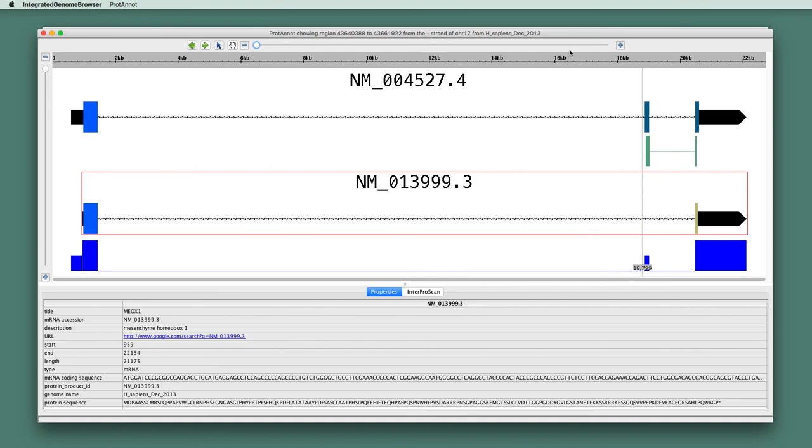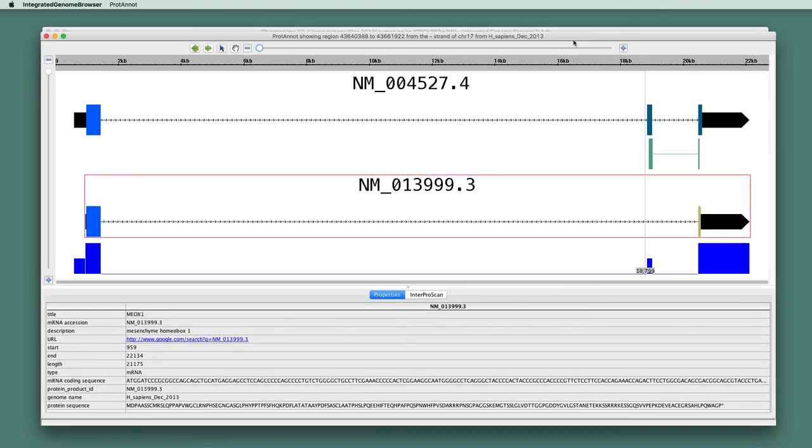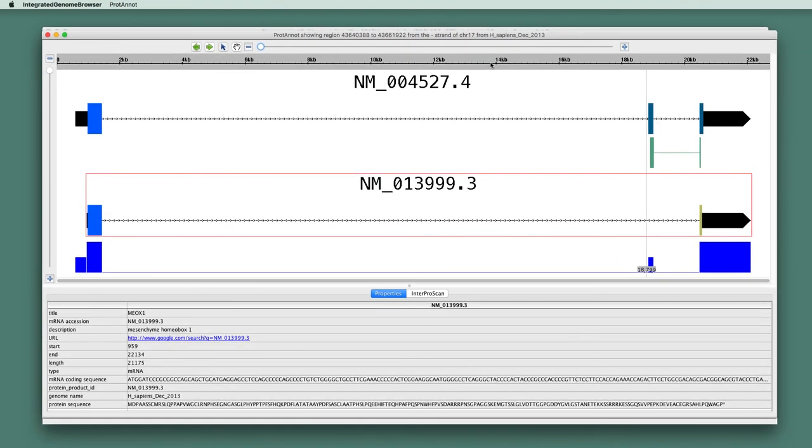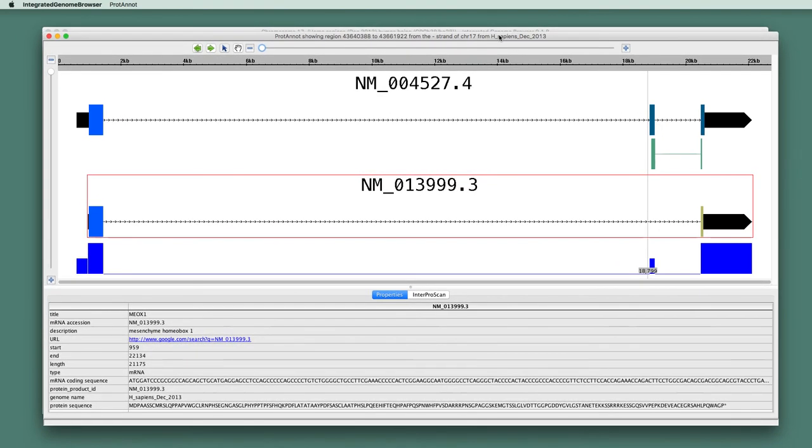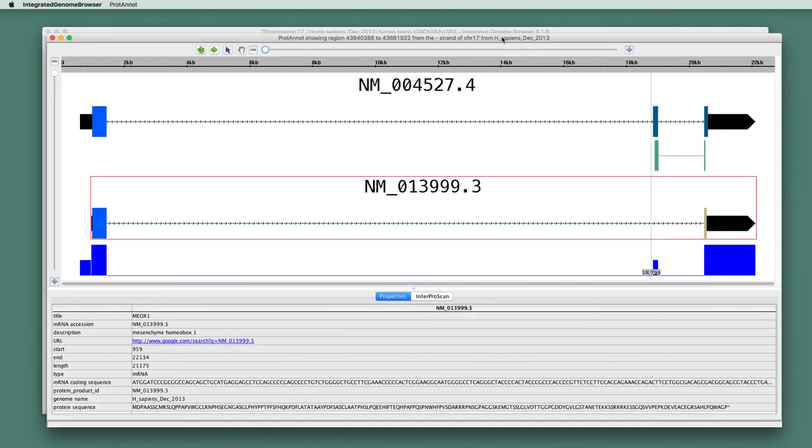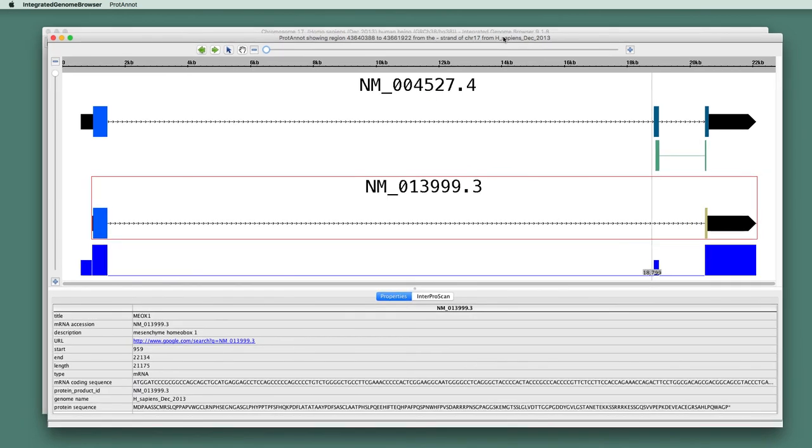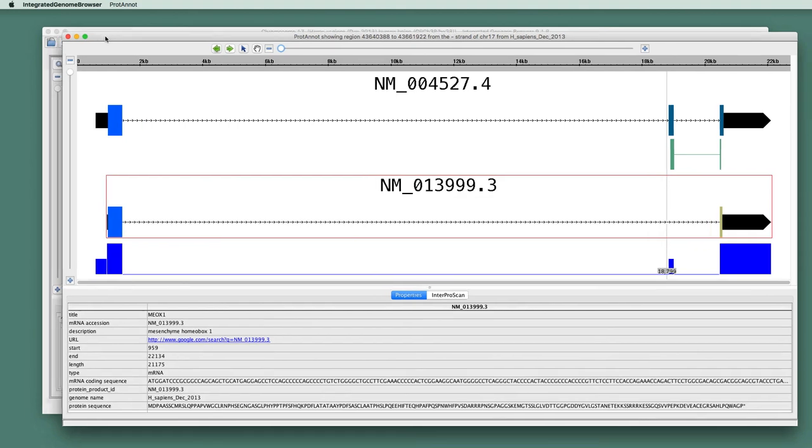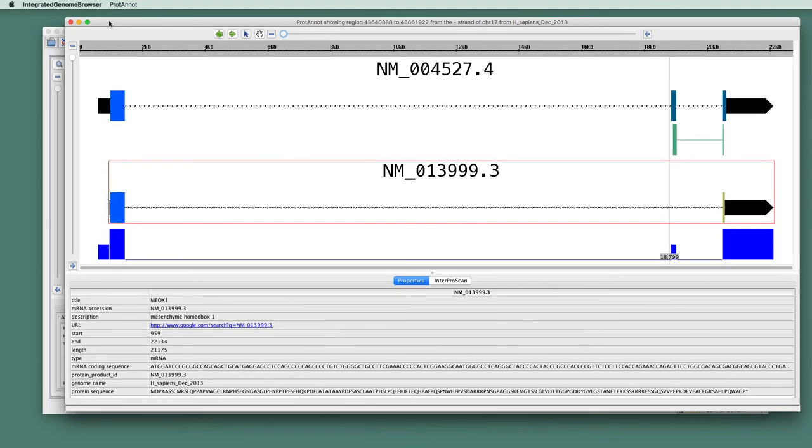So this shows an example of how you can use ProtoNote, which is an IGB app, to understand the consequences of alternative splicing in this particular case.